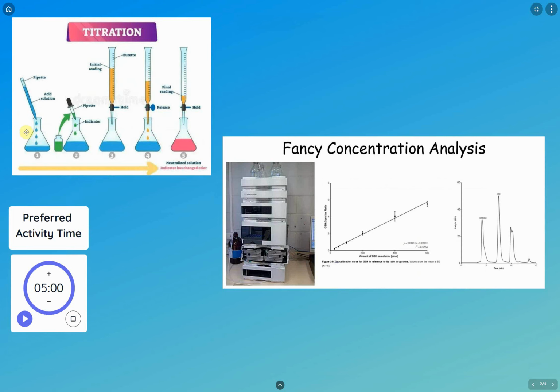So what we're going to be using is something called the titration equipment. And what you're going to be doing is the exact same thing. You're going to have acid and base. You're going to mix those two things together. You will have an indicator to help you indicate when it's hit that neutral zone. And you will be able to figure out volume and concentration to figure out amount of acid used and amount of base used. So this is what the titration equipment looks like. And then you guys will be doing some calculations to figure out the concentration of unknowns.